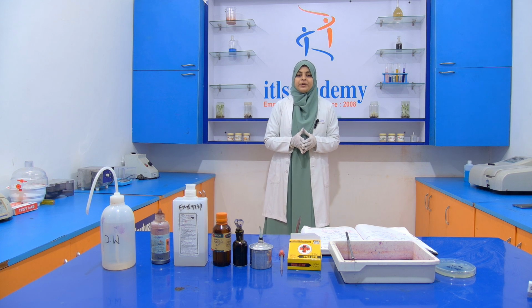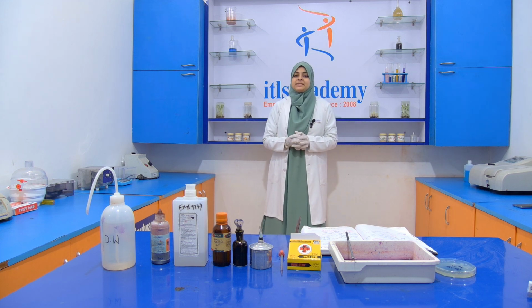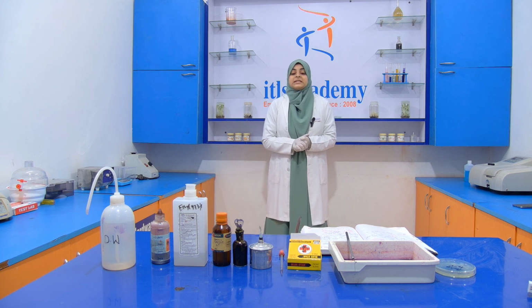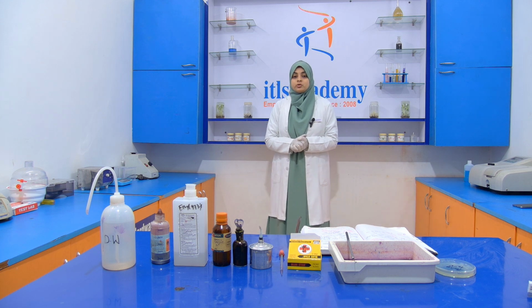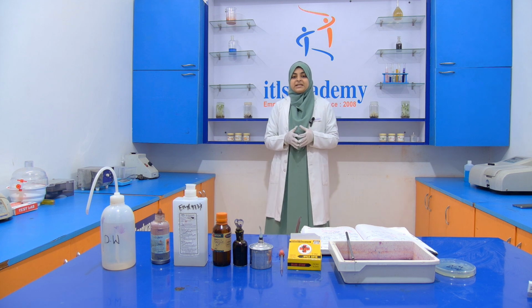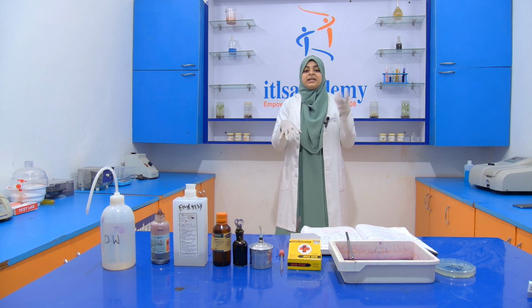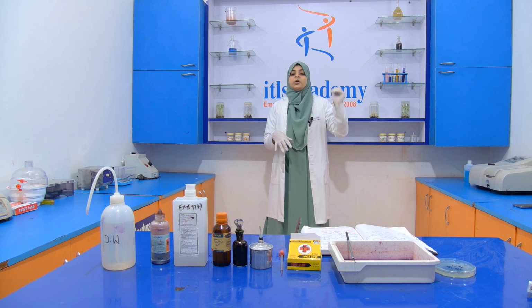Today we are going to perform another experiment, that is gram staining. Before starting the gram staining, we are going to discuss staining. Staining is a microscopic technique used to contrast the microscopic image, which means the image that we get from the microscope. Staining creates easy visualization of that image. That's why we do staining.